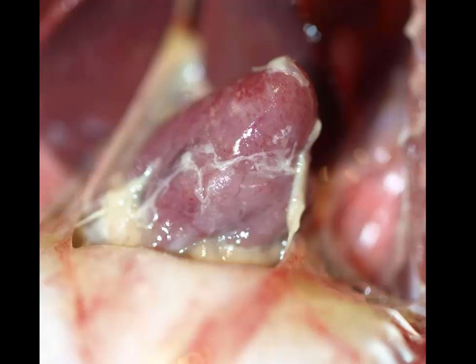Think of fowl cholera. There's often a lot of hemorrhage associated with it, once again, think of fowl cholera or Pasteurella multocida, where one of the classic lesions is going to be hemorrhage throughout the body. So we see the vasculitis here. We see the fibrin within the pericardial space, and that should give you a very good clue as to the pathogenesis of this. And it is very much associated with pasteurellosis in birds. So they renamed this one Riemerella, but new duck disease, Riemerella anatipestifer.